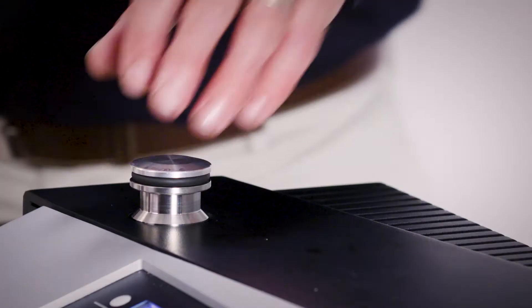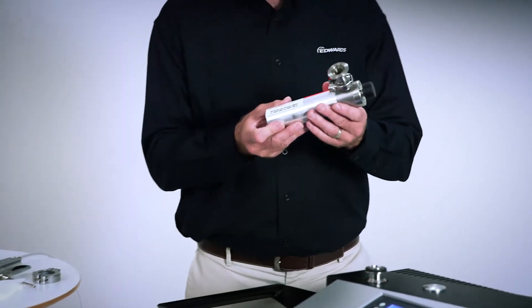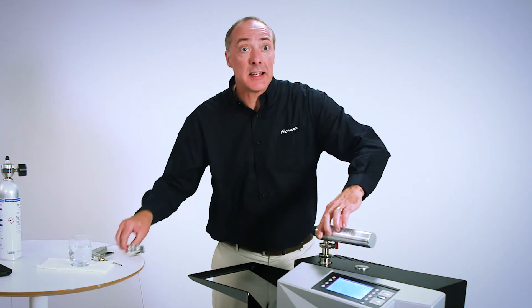For this demonstration, I'm going to use an external calibrated leak first in order to simulate an actual leak. I'm connecting this calibrated leak to the test port using a centering ring and clamp.